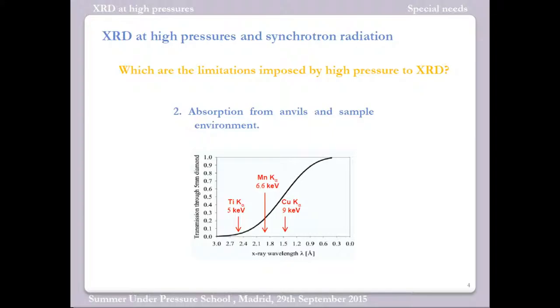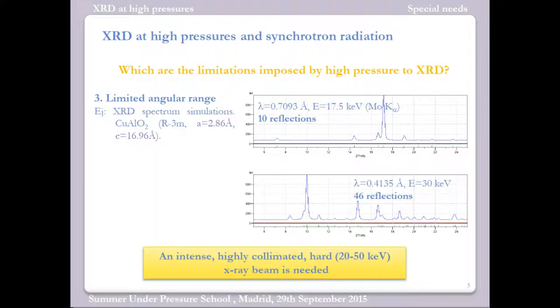Also, you have a sample environment, and it's well known that if you want to reduce absorption, you have to work with higher energies, so we need hard X-rays. An additional advantage of hard X-rays is that you have more reflections.